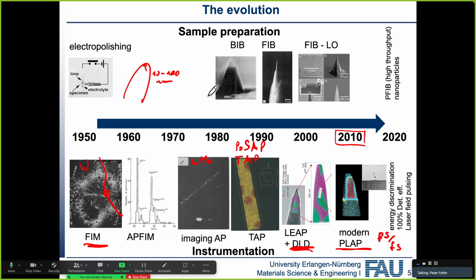So what then came about was ion beam-based preparation methods. In the 80s, we started seeing broad ion beams, because an ion beam will form a cone shape on a specimen anyway, just because of ion beam physics. There were some results from that, but very, very limited.